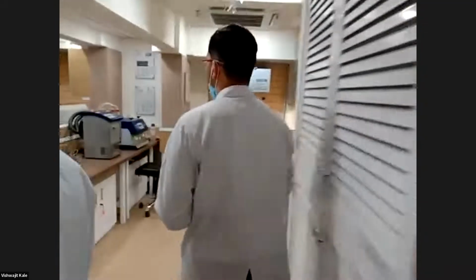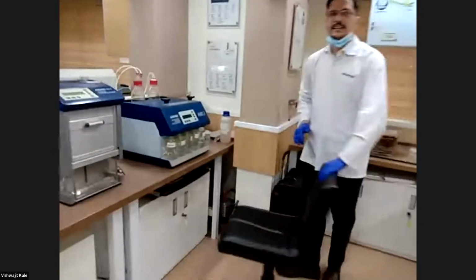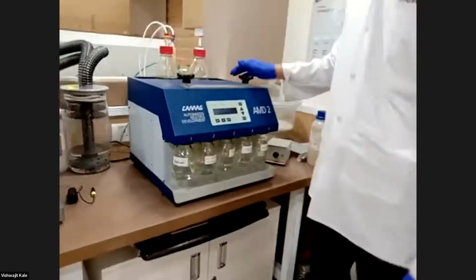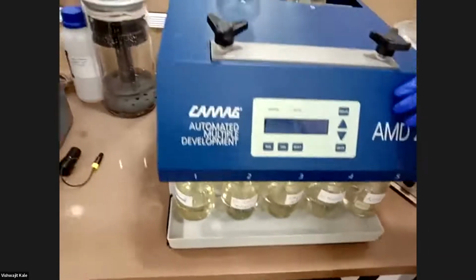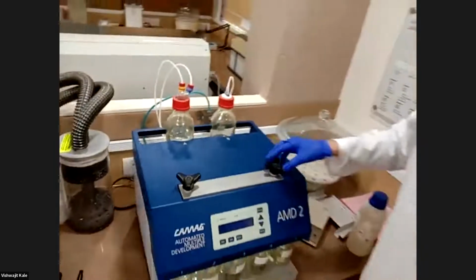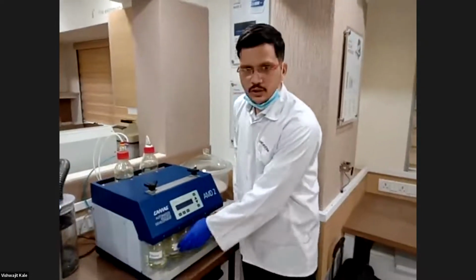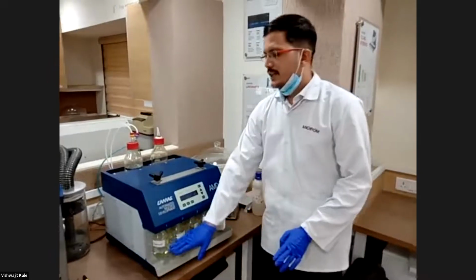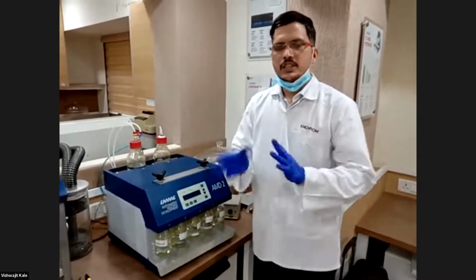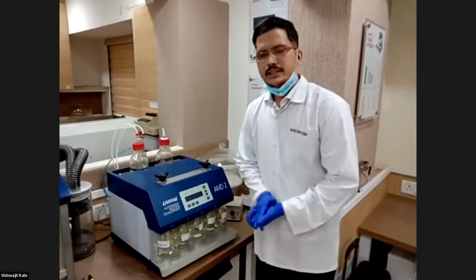We have other development option available with us also, that is gradient type of HPTLC plate development we can do. For that we can use AMD2, automated multiple development module by Camag. Here gradient type of HPTLC we can perform. At a time 5 different solvents we can keep in these 5 different bottles given, or in a single bottle we can keep a mixture of 2-3 solvents. Different mobile phases we can put in these bottles.